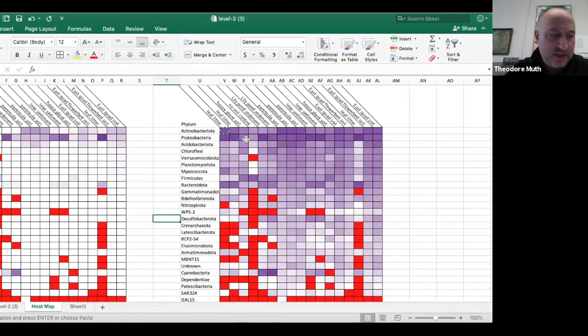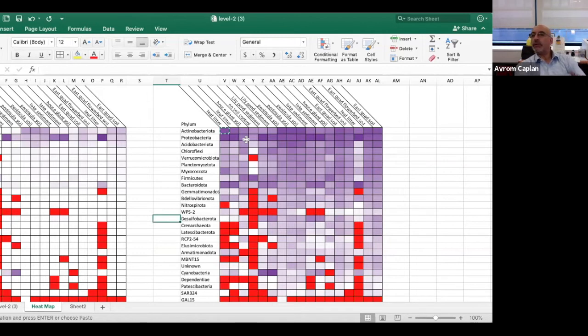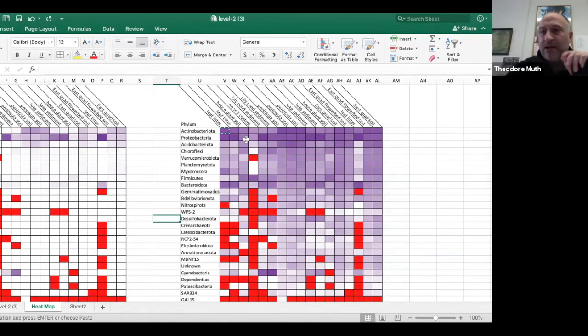Are there other questions, Avram? Yeah, there is one. Karen Thickman asks, what would it look like if you arranged the columns based on the PCA results, on the principal components analysis results? Right, okay, so I'm going to direct you to the StatsQuest video on heat maps.